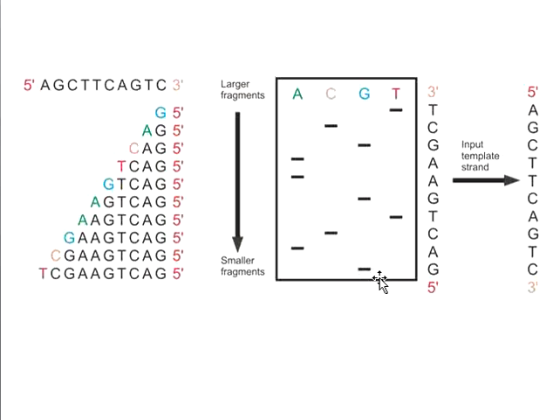So the first nucleotide we have is G. The second band we get is in the A well, so the next nucleotide, according to the addition of dideoxyadenosine triphosphate, is A. The third band we get is in the C well, so our next nucleotide is C, because this band length was produced due to the addition of dideoxycytidine triphosphate.